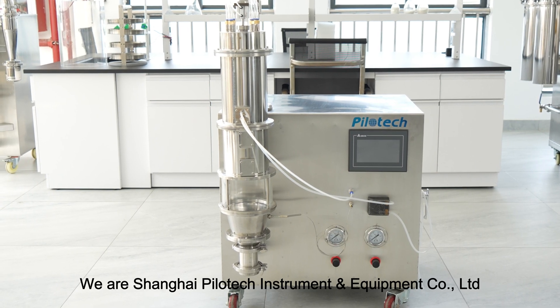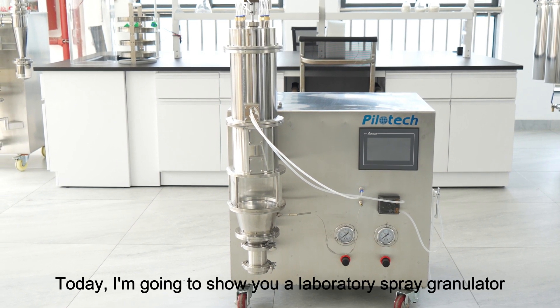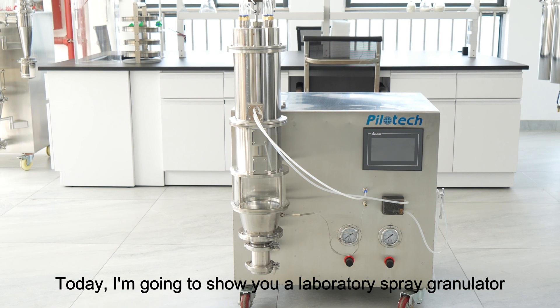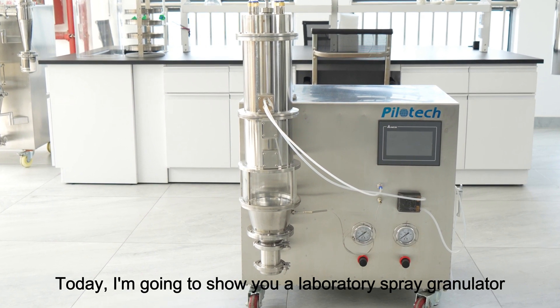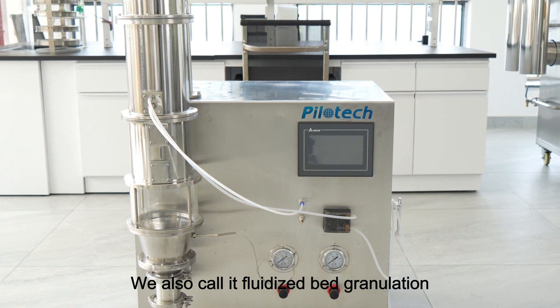We are Shanghai Pilotech Instruments and Equipment Company. Today, I am going to show you a laboratory spray granulator. We also call it Fluidized Bed Granulation.